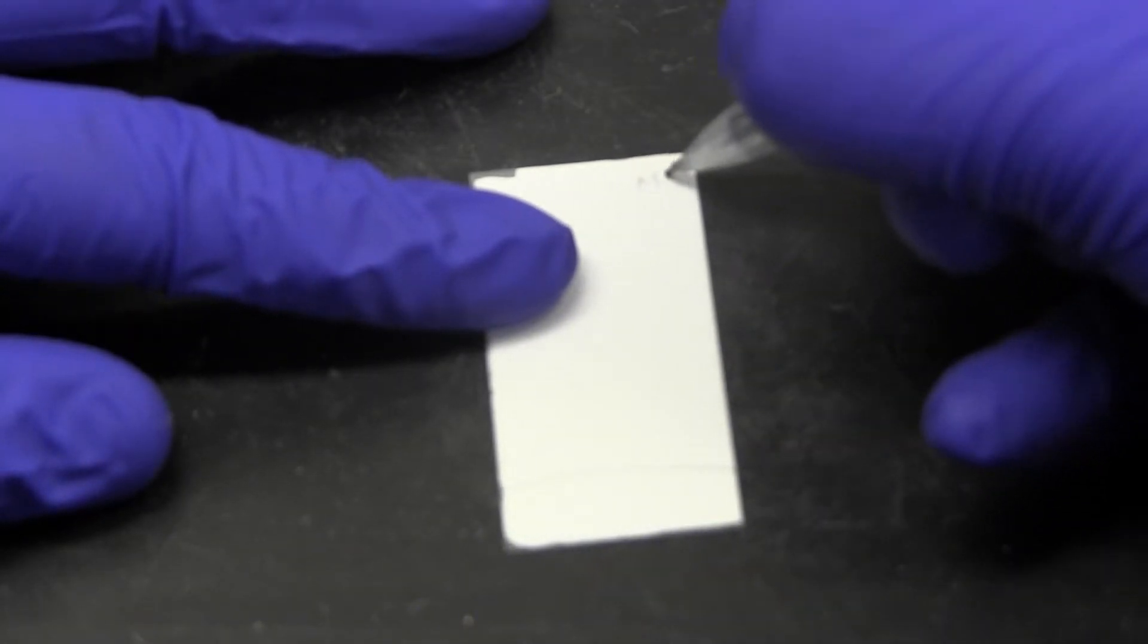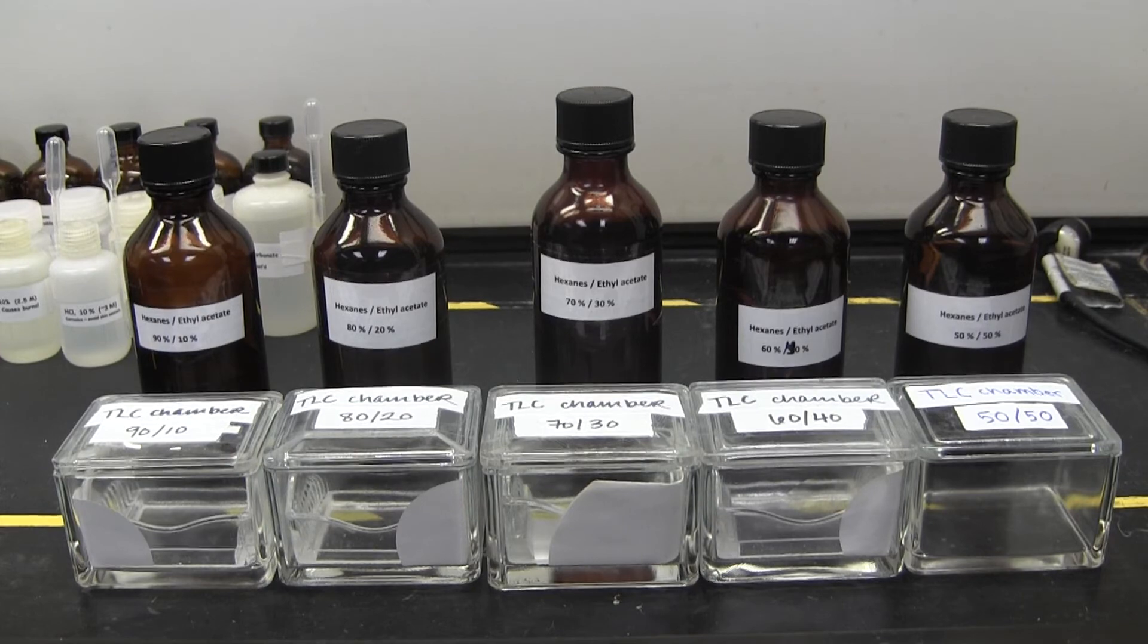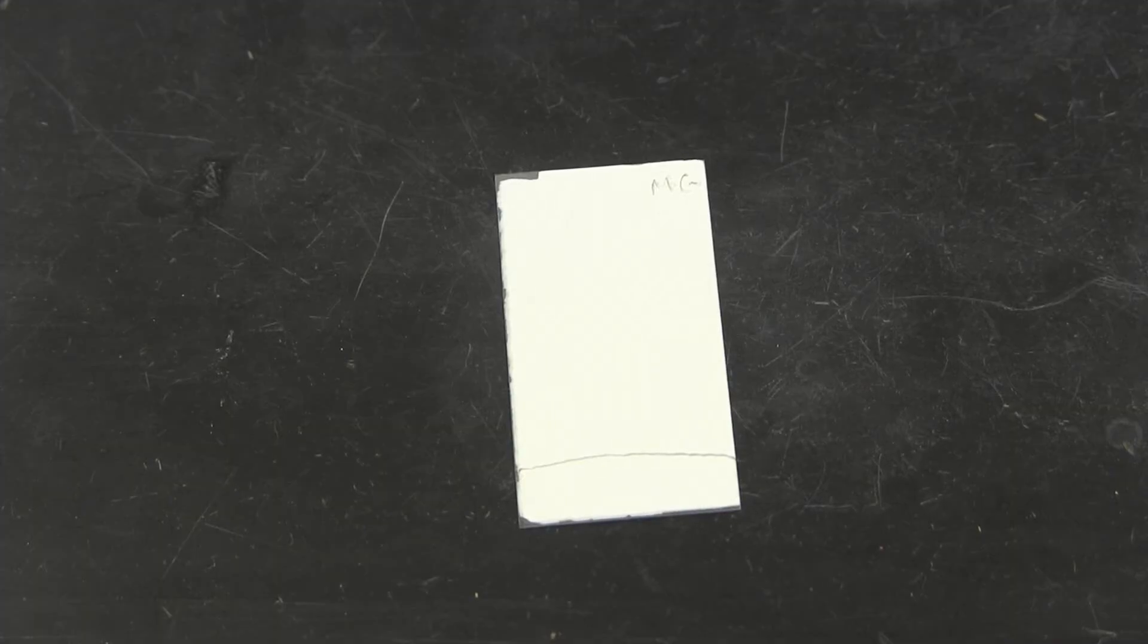Also, write your initials on the plate so you can identify which is your unknown. You will be testing many different solvent ratios of ethyl acetate and hexanes to determine which best separates your unknown. Use one plate for each solvent mixture you plan to test. We recommend having a classmate or two share a plate with you.